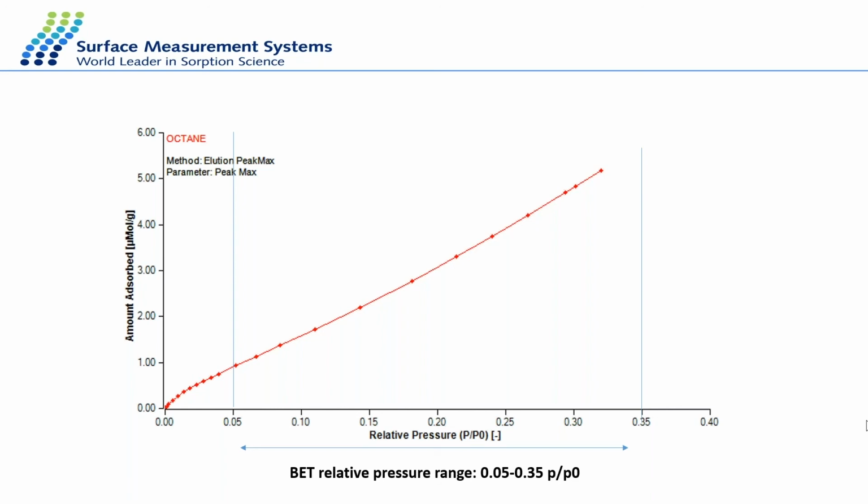That's why we have this target and actual coverage, just to double check whether there is any chemisorption or absorption of the probes into the sample. And of course, if you see a significant difference between target and actual, that can mean that maybe there's chemisorption or absorption.